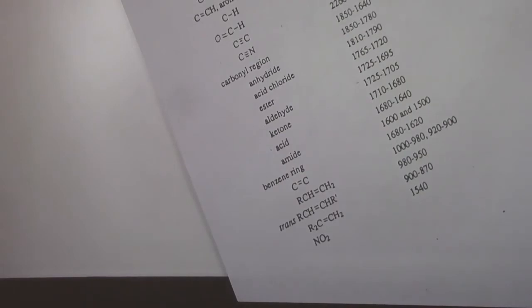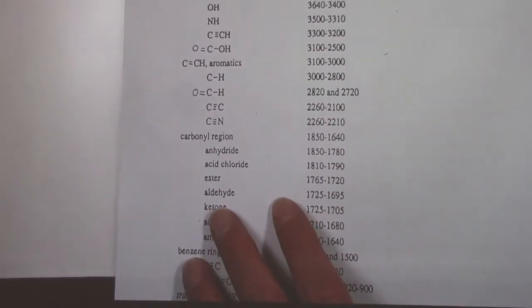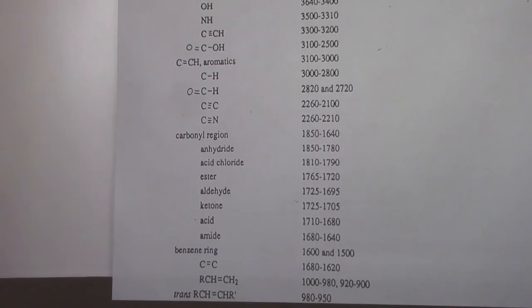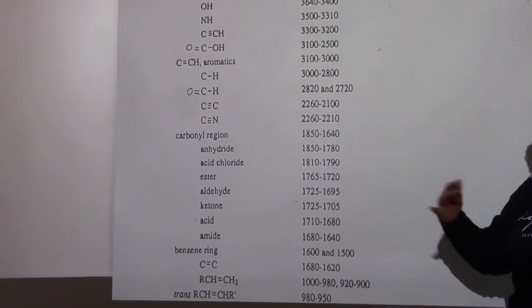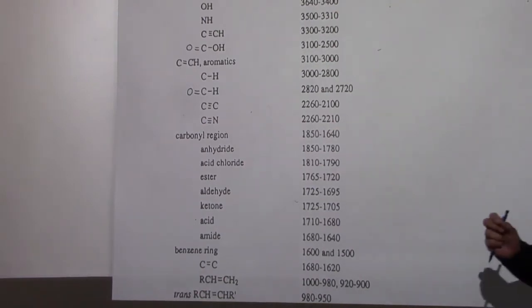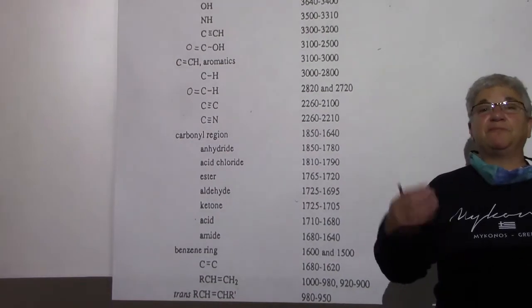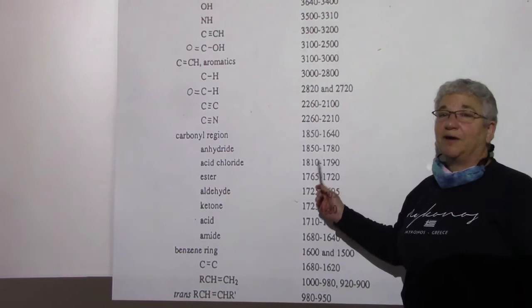Okay, I think I don't have these in quite the right order in your manual, but now you want to go to this chart that says characteristic frequencies. I'll go through and mark up the ones that you're going to have to know and where you're going to see specific examples of these in the later pages. But when I say know, I mean be familiar with. I do not in any way expect you to memorize these numbers.